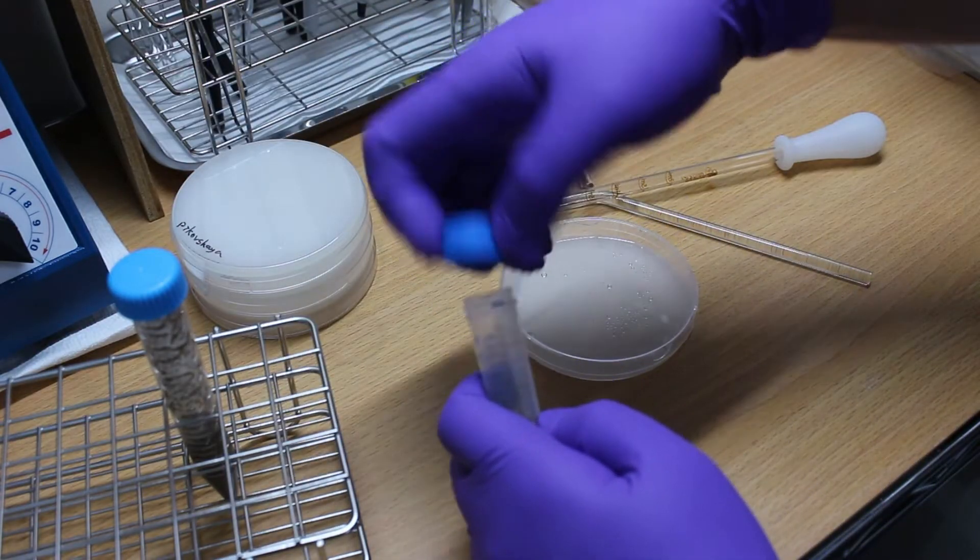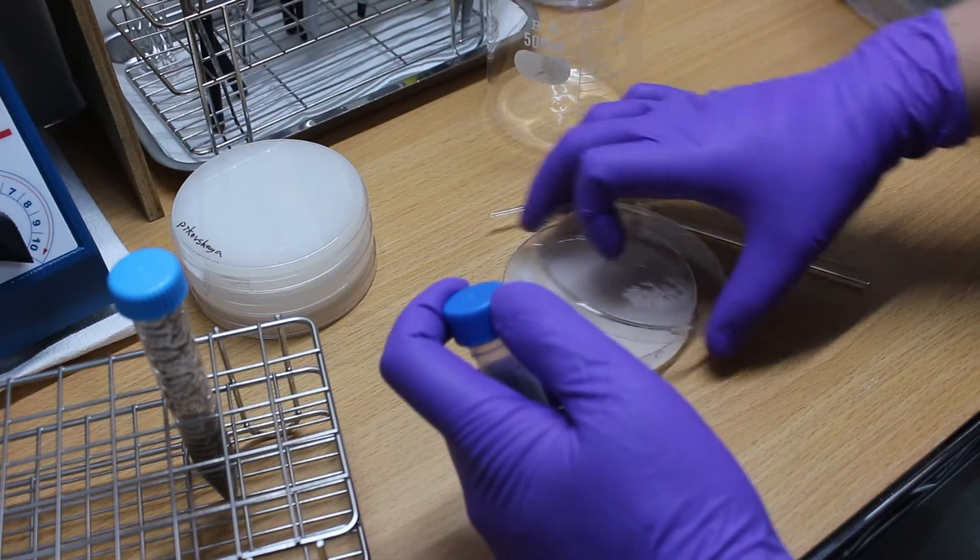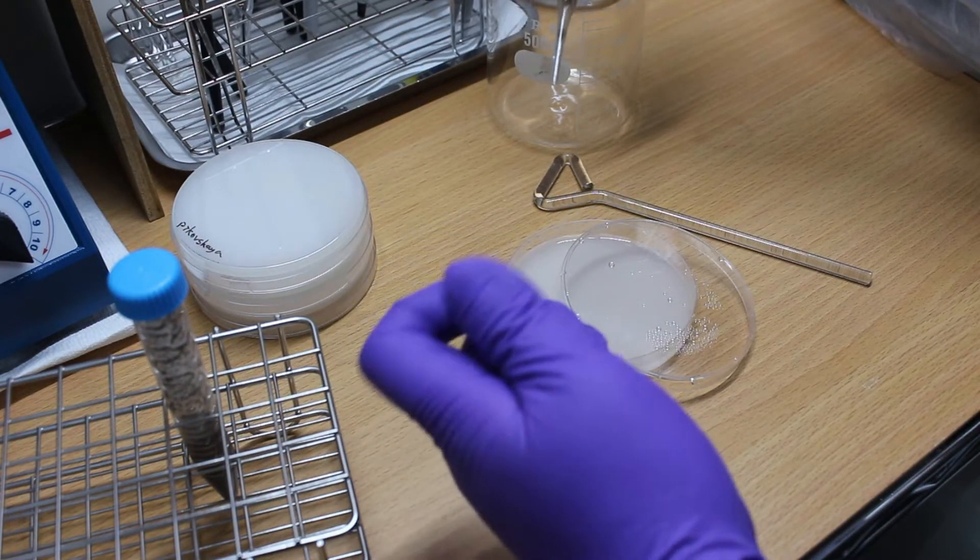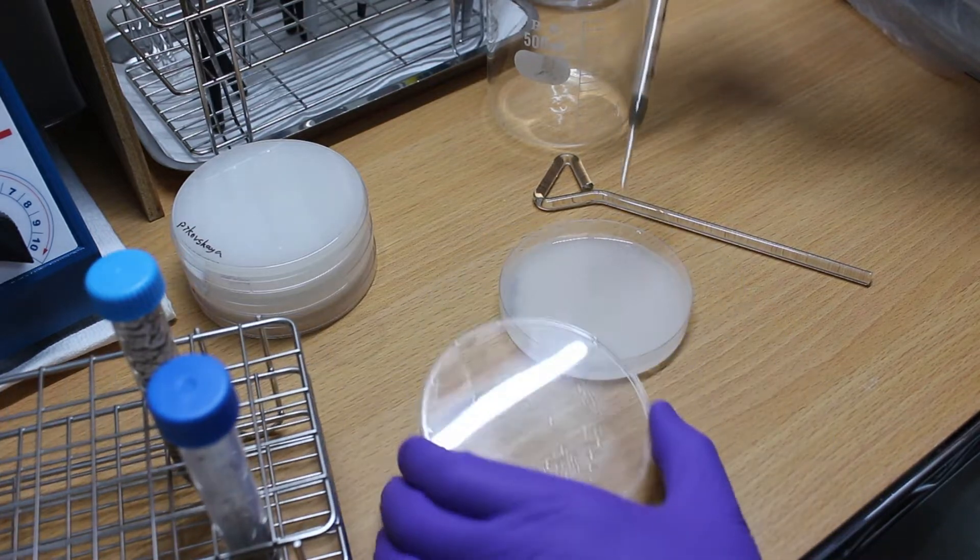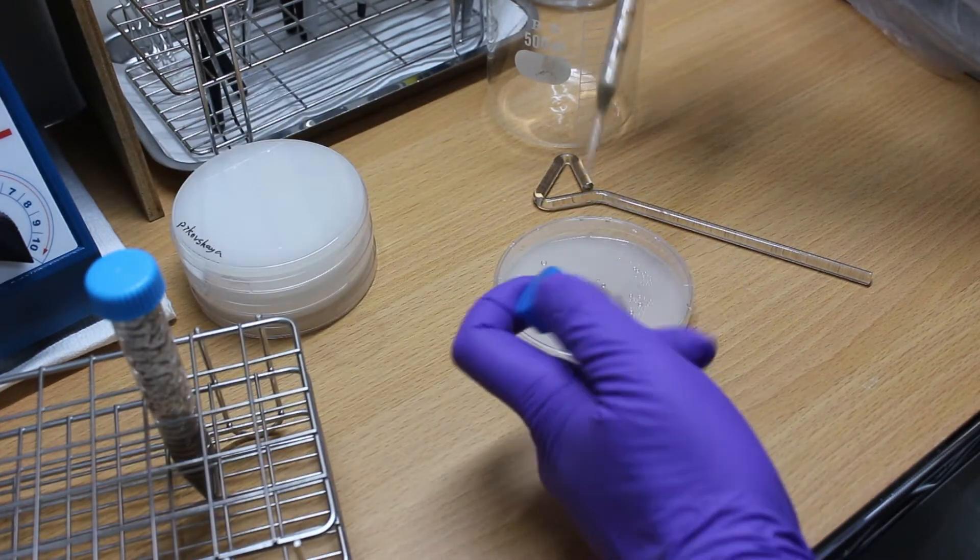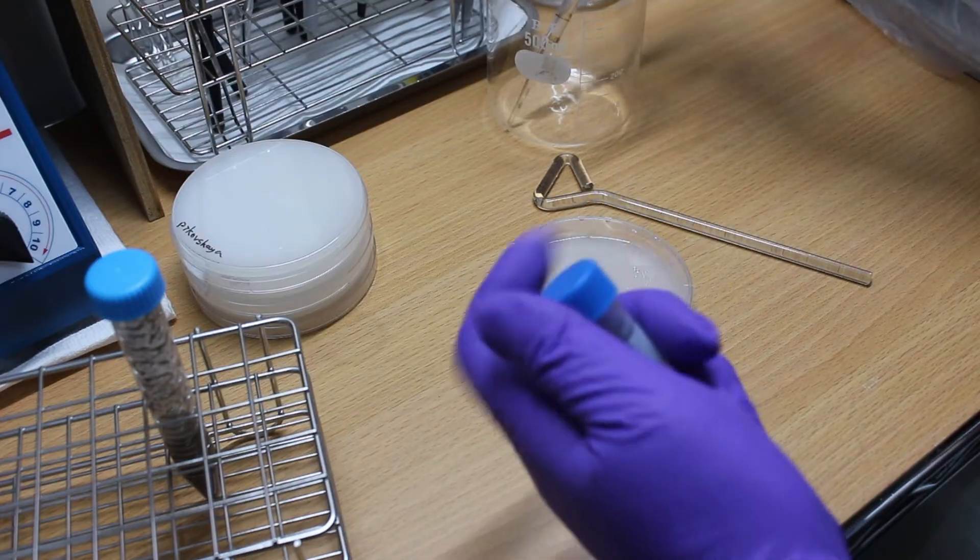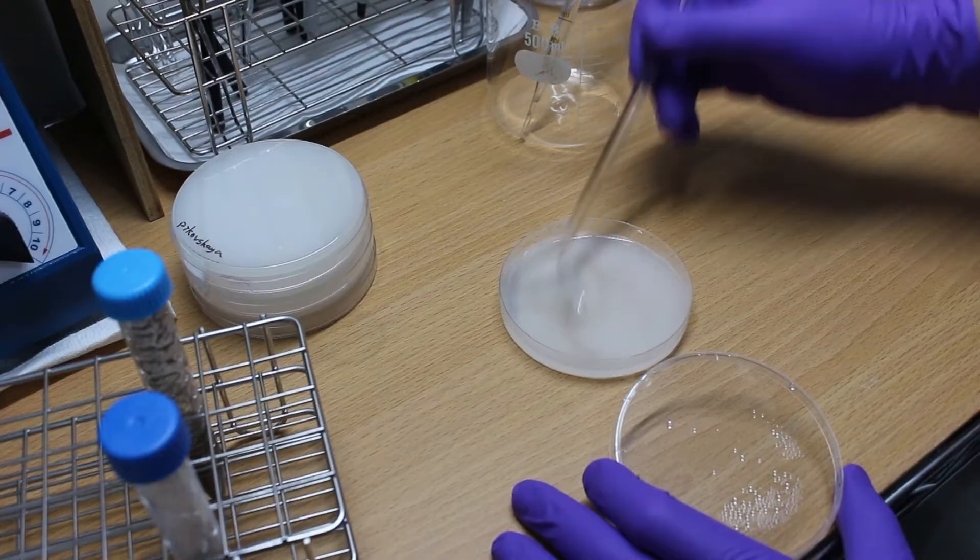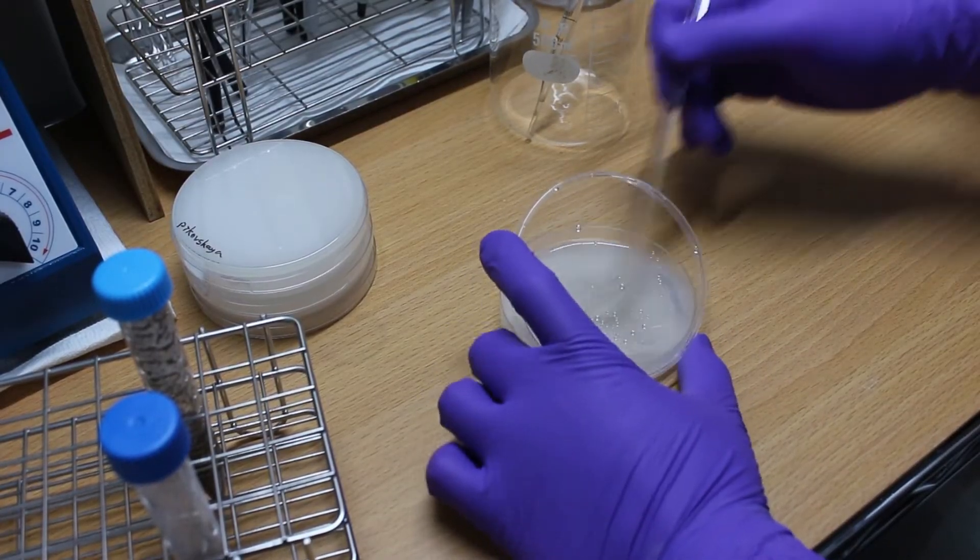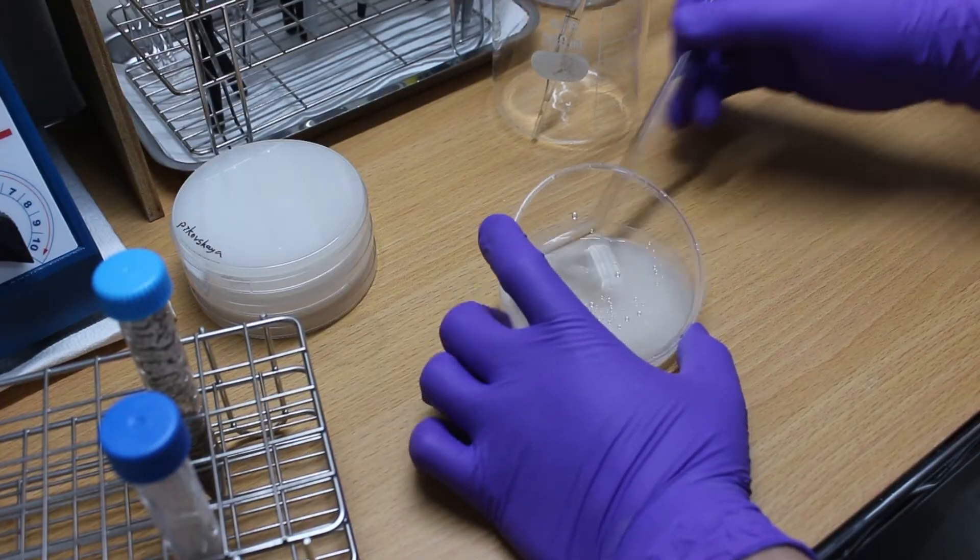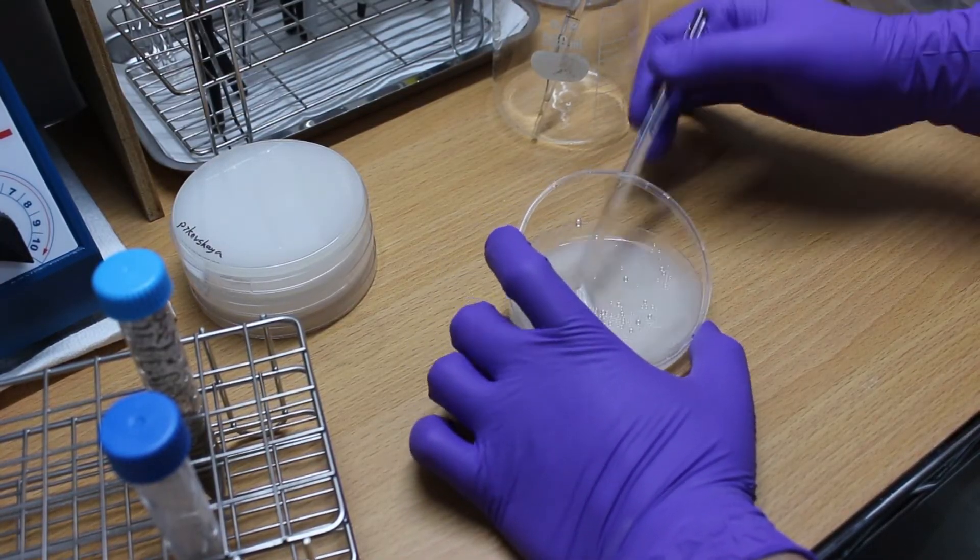Then use a dropper to drop the water onto the culture medium. About 1 to 2 drops is enough. After that, use a spreader to spread it evenly until dry. The agar plate I'm using here is Picoviskaya's agar, which is a culture medium for screening PSB. I already made a video on how to make this agar at home, so you can go check it out after you watch this video.